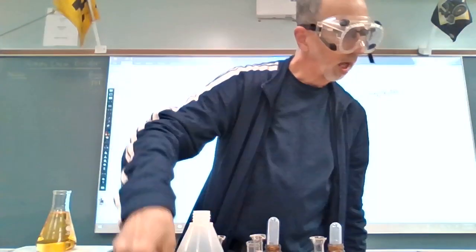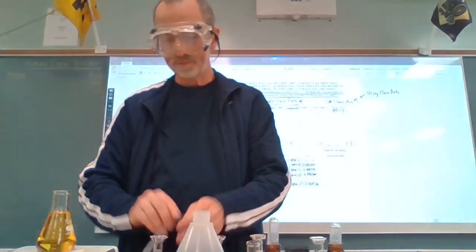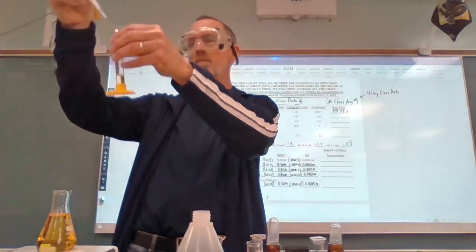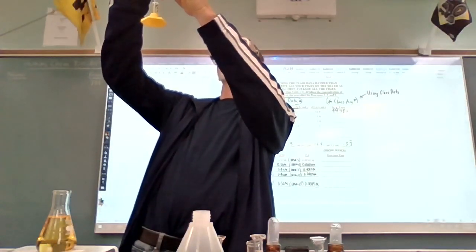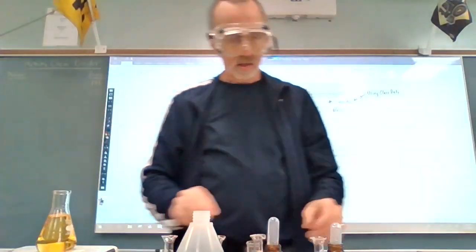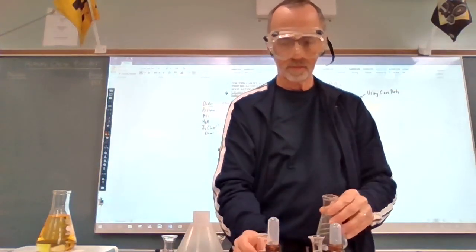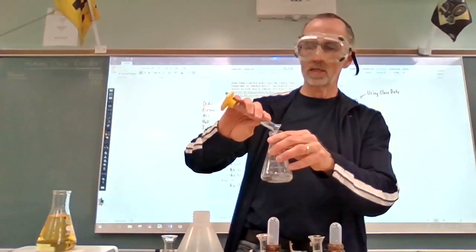And iodine again this time is also 5. Again, I'm going to pour the first 3 in the order we discussed.